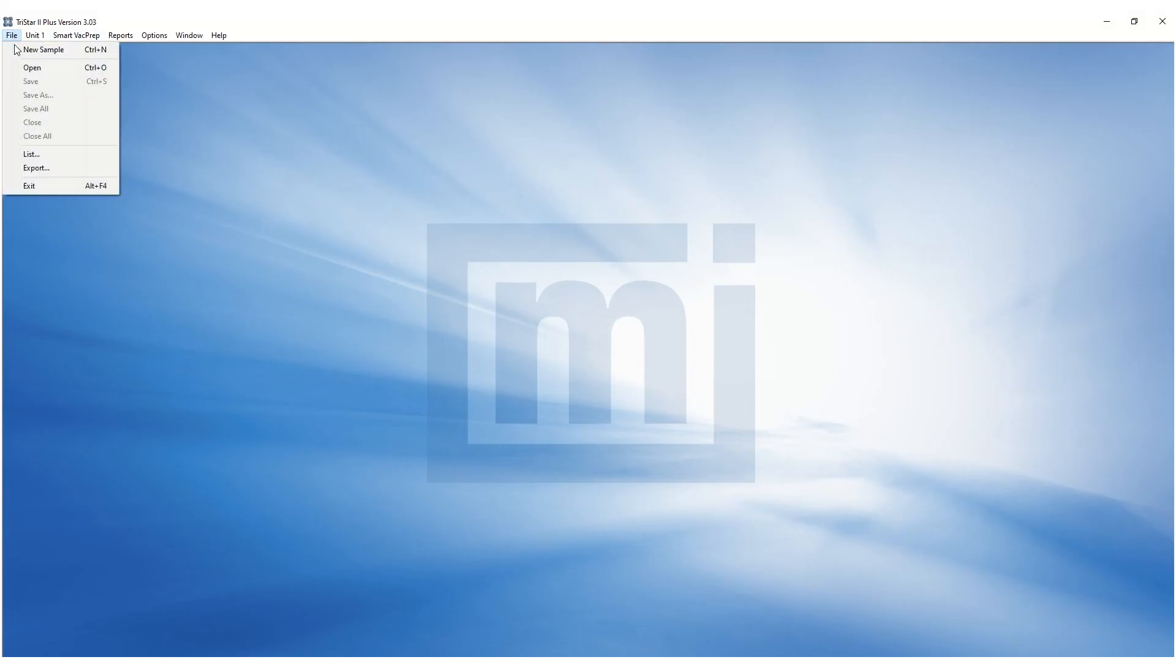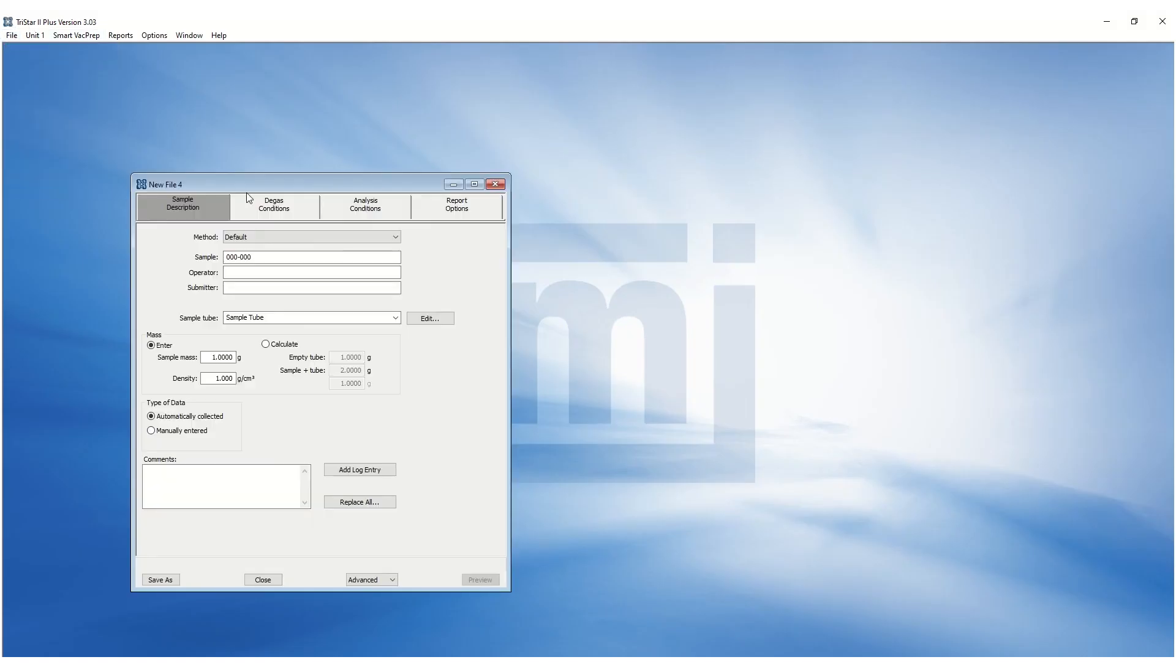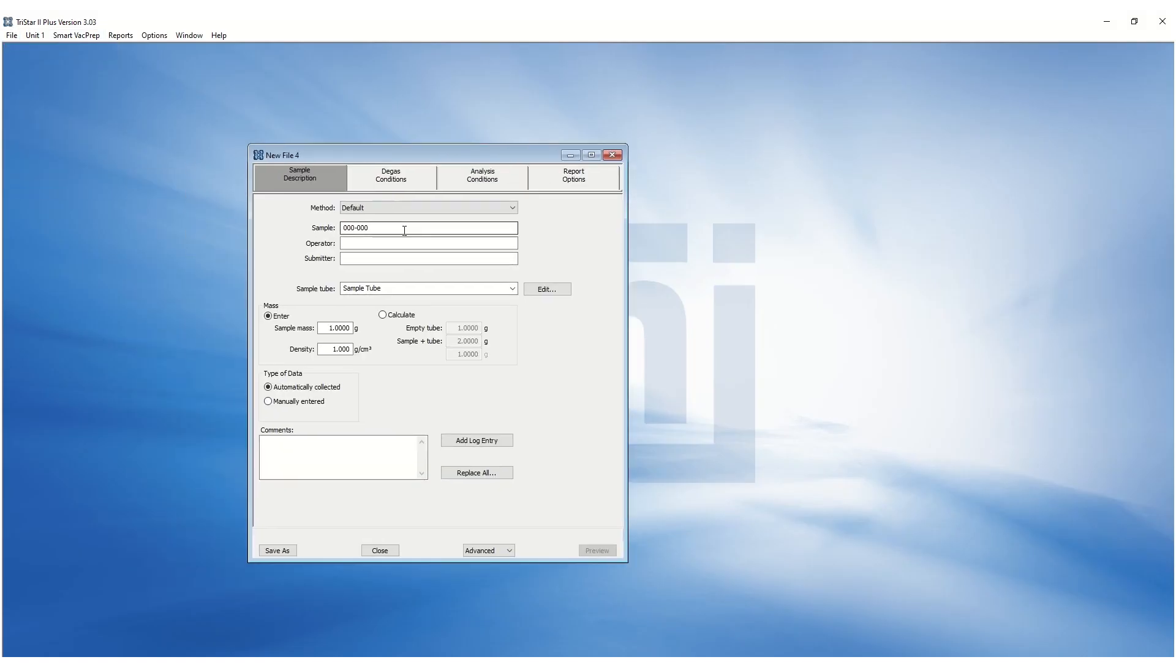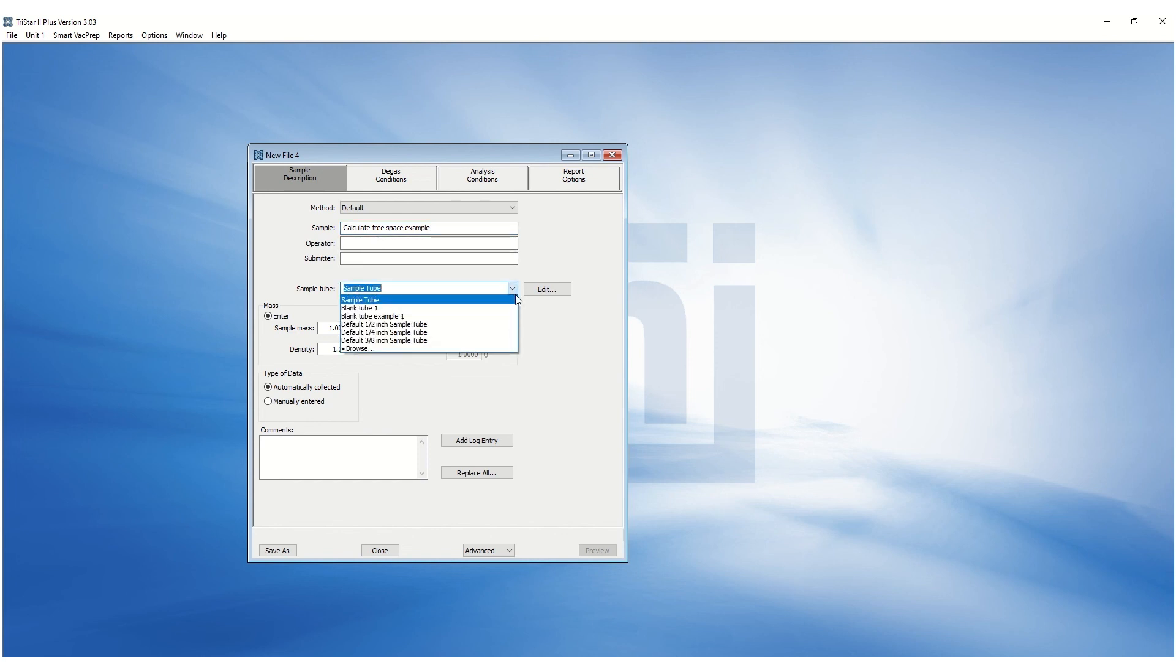Next, go to the File menu and click on New Sample to create a new sample file for the sample analysis. First, under the Sample Descriptions tab, click on the Sample Tube drop-down menu to select the tube used for this analysis.